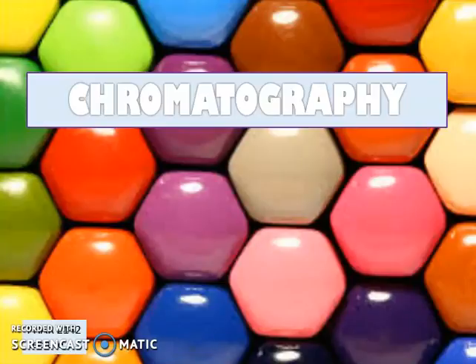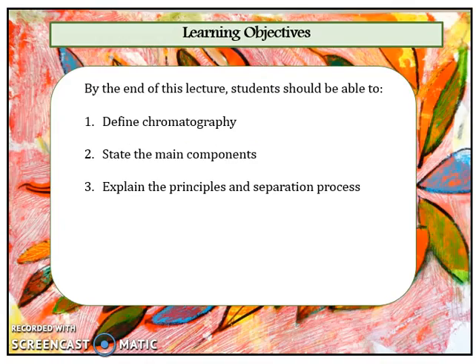Introduction to Chromatography. By the end of this lecture, you should be able to define chromatography, state the main components of chromatography, and explain the principles and separation process.